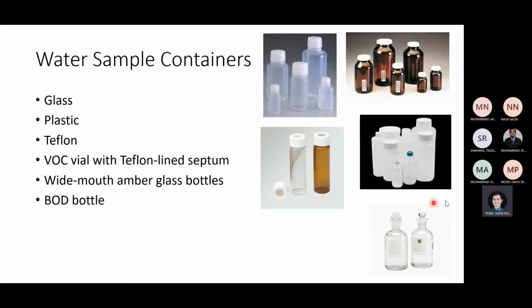So this is polyethylene, high density polyethylene. The famous one is this one now, because why? Cheap, light, very durable, and can be used over and over again.